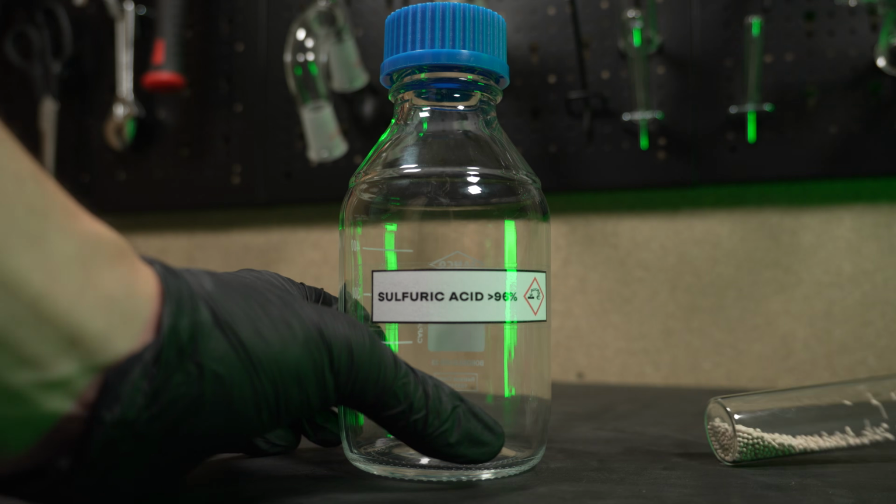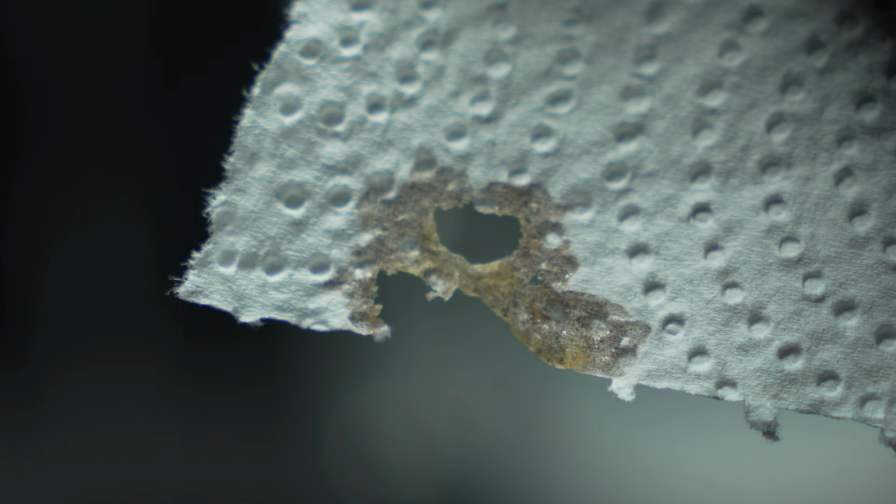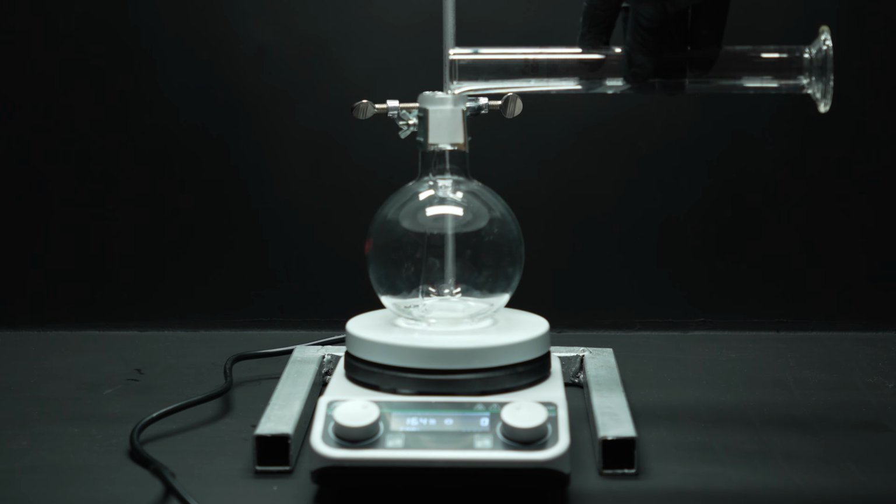Fast forward a year, I've got the itch again. Time to get that true chemical banana. Step 2. Isoamyl acetate. Attempt 2. And I think you already guessed. This time there will be no molecular sieves, there will be sulfuric acid, concentrated. We're repeating the same procedure as before.